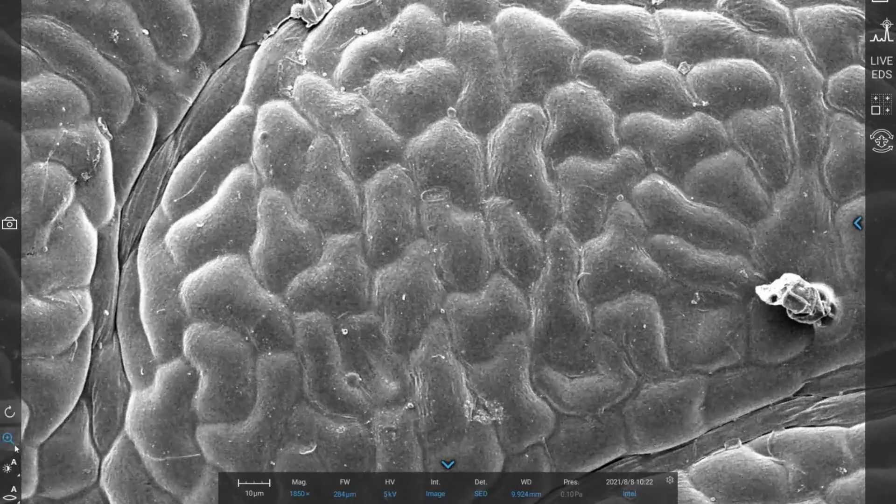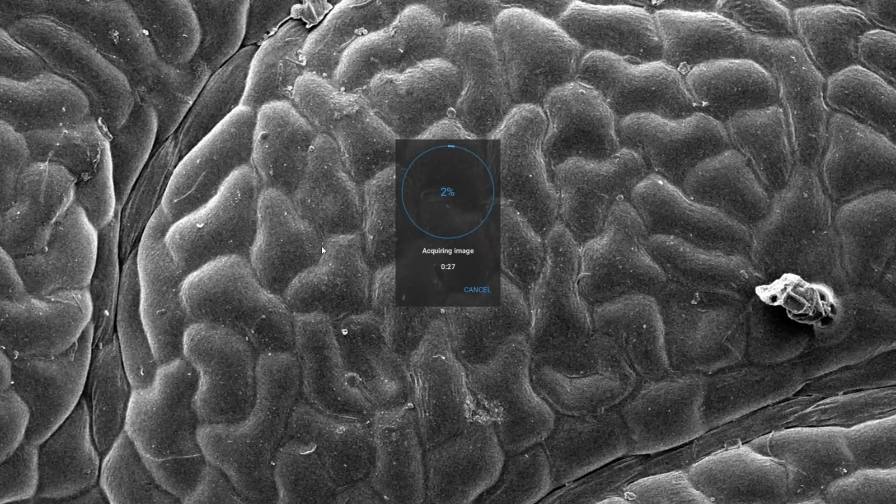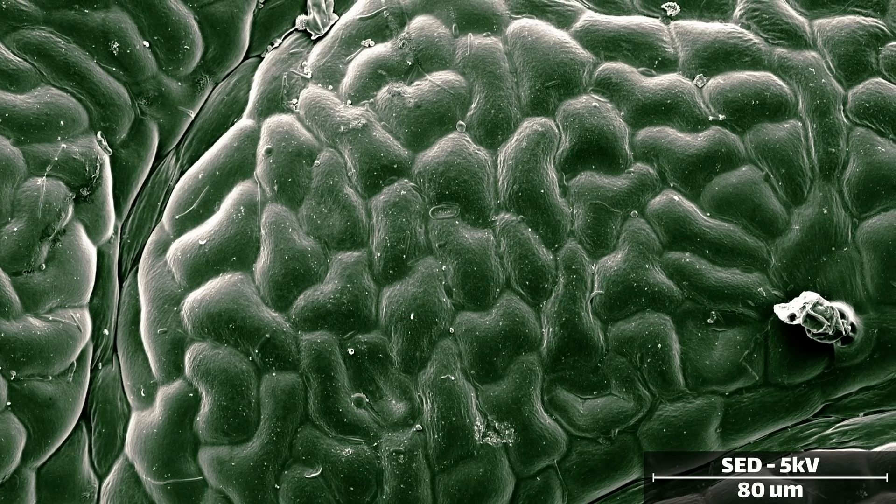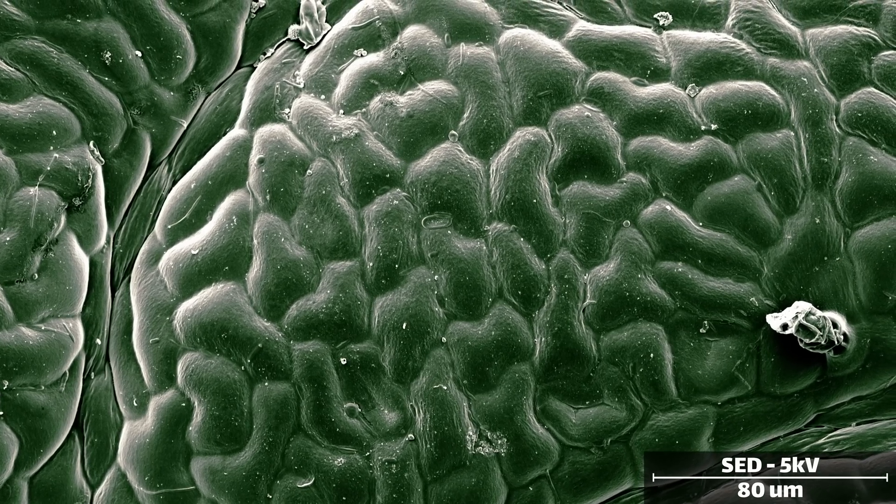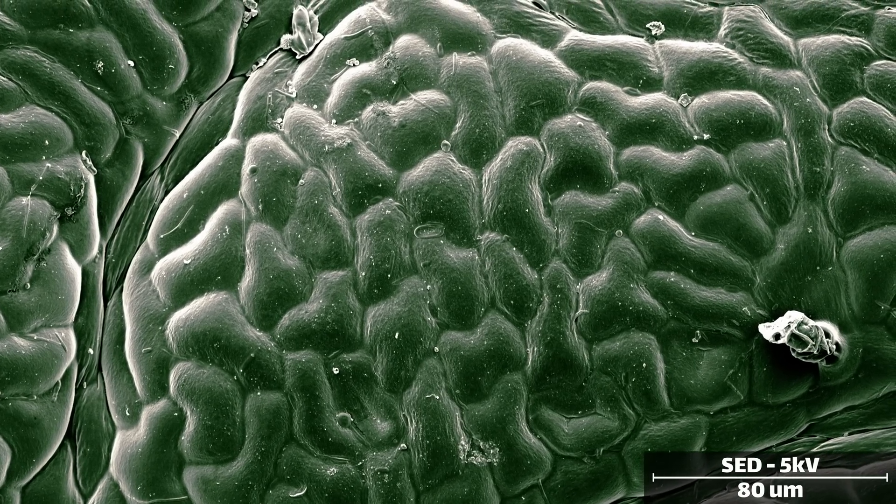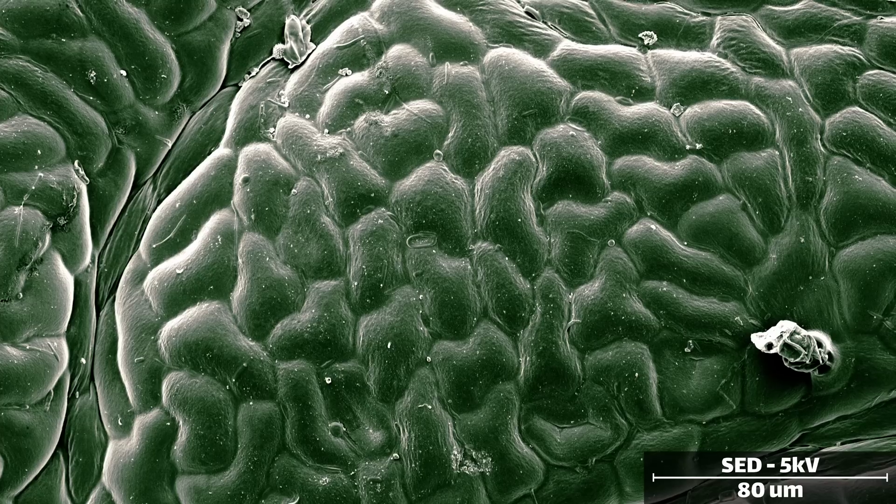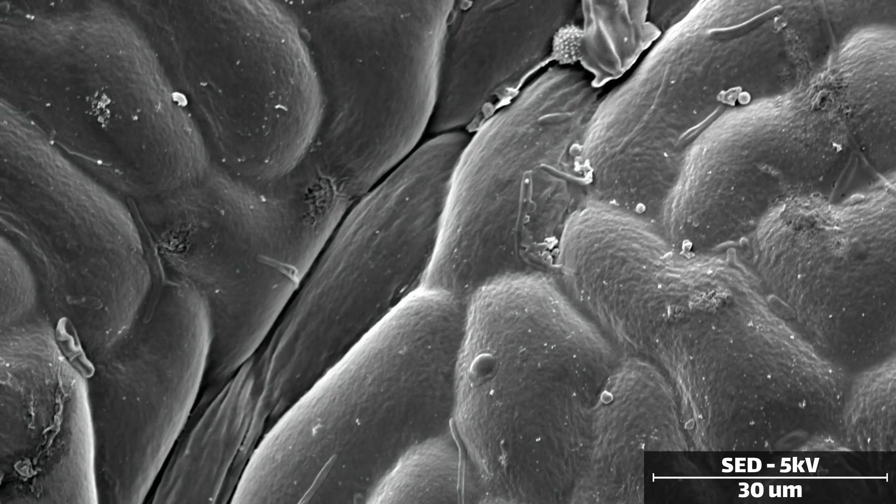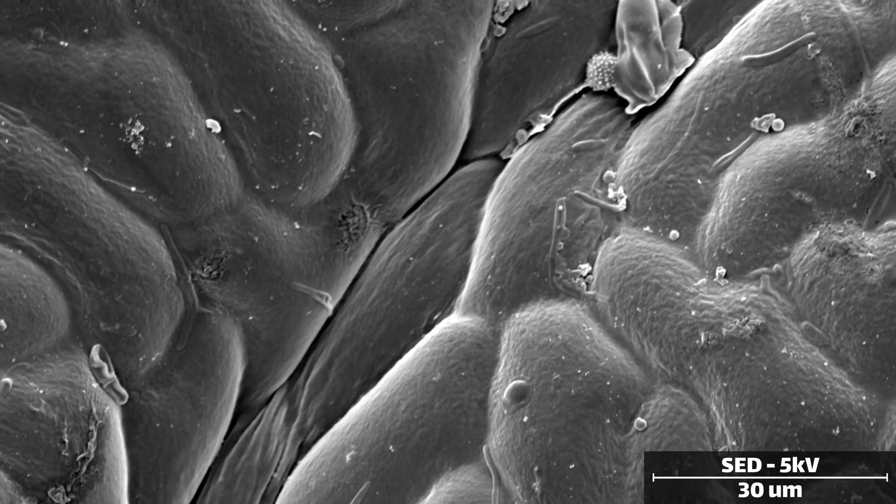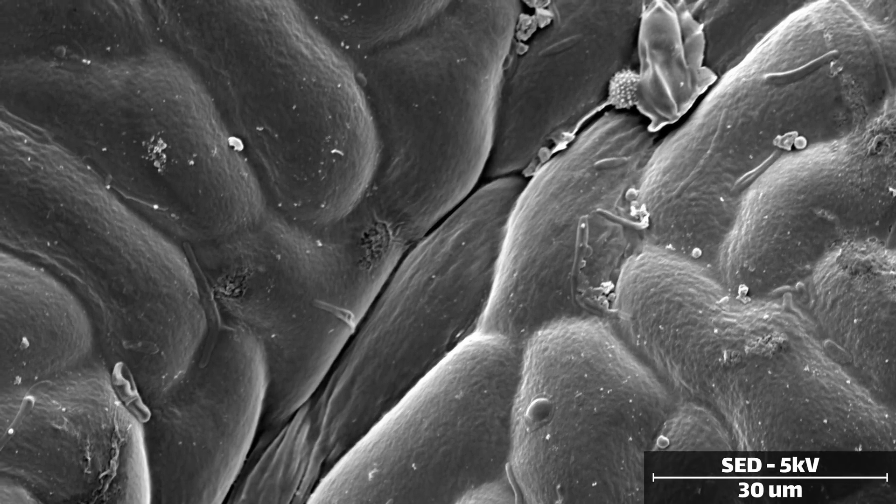Turning our attention back to the goldenrod, let's take a look at the leaves. While not as varied as the structures of the flower, there are still some interesting landmarks. Here on the top of the leaf, we see the upper epidermis. Each blob is a single cell, laid flat across the leaf, forming a protective barrier against the outside world.